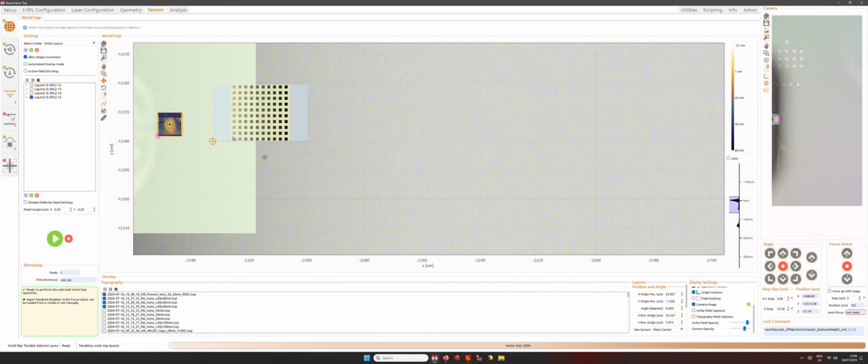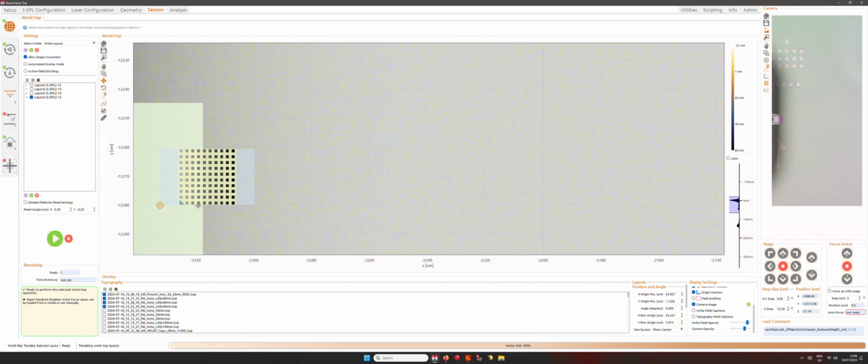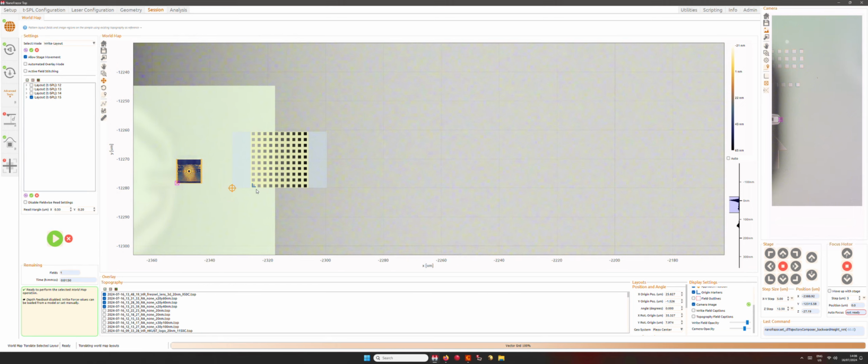So we have 30 nanometers of PPA, and below we have 100 nanometers of PMMA. Maybe the patterning is not going to look as expected the deeper we go with a temperature force map, because we will probably pattern into PMMA, but we can see how it looks.